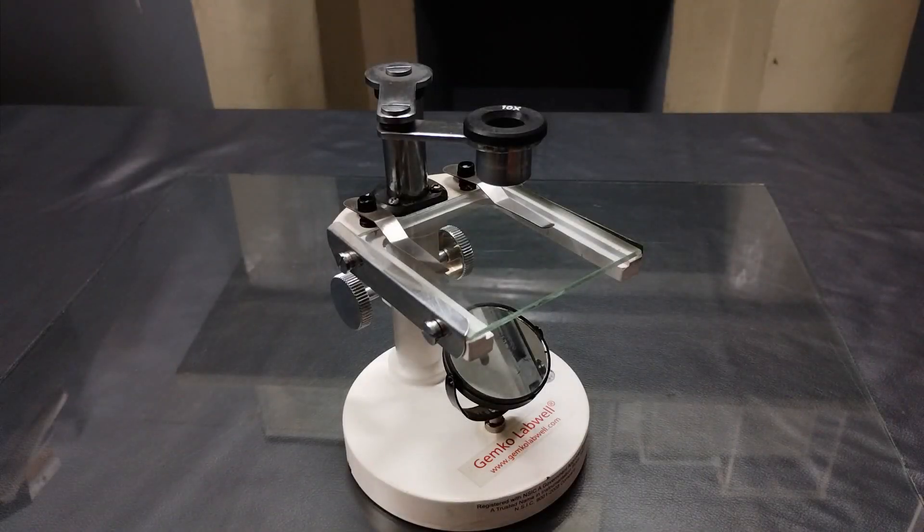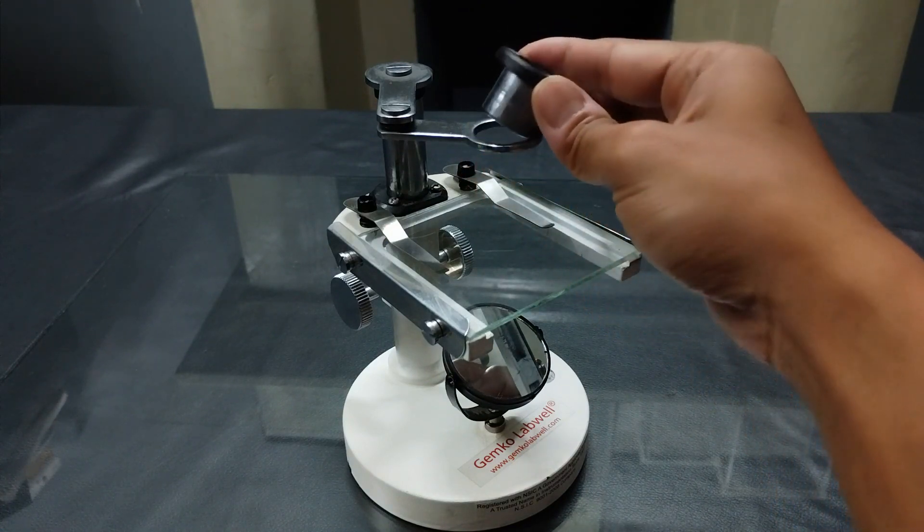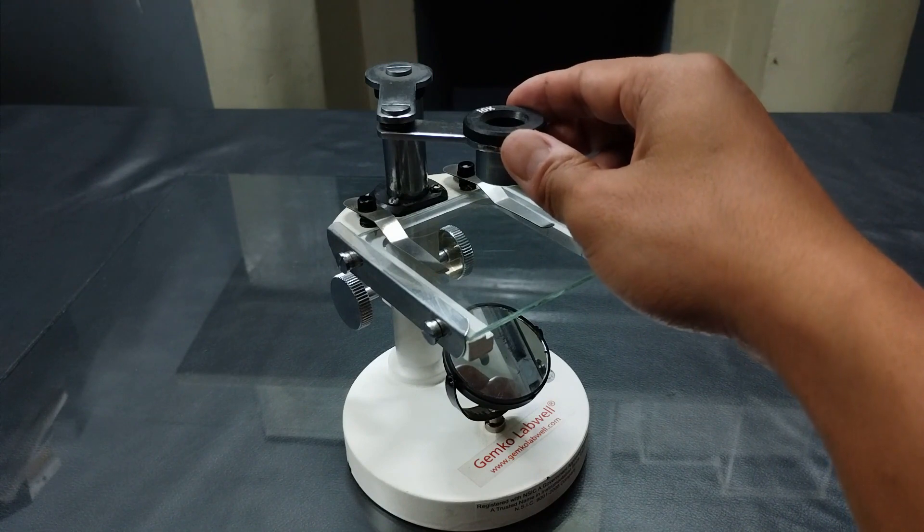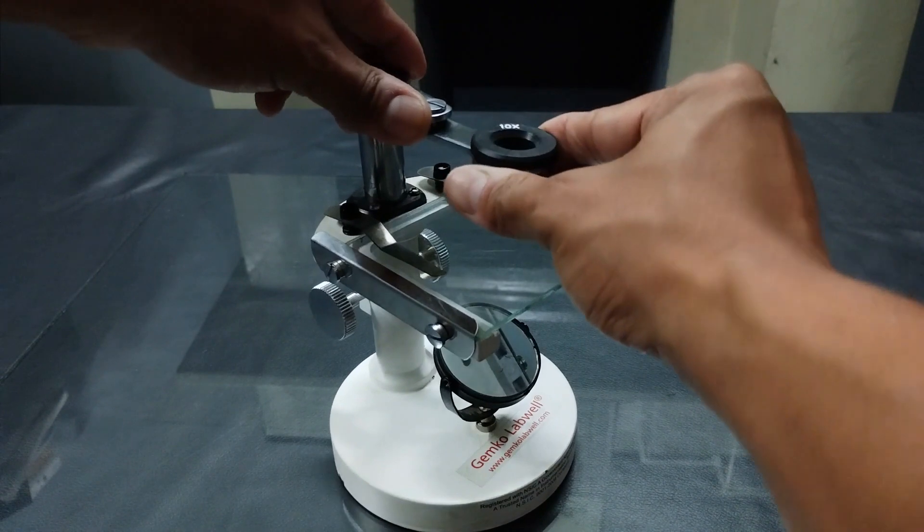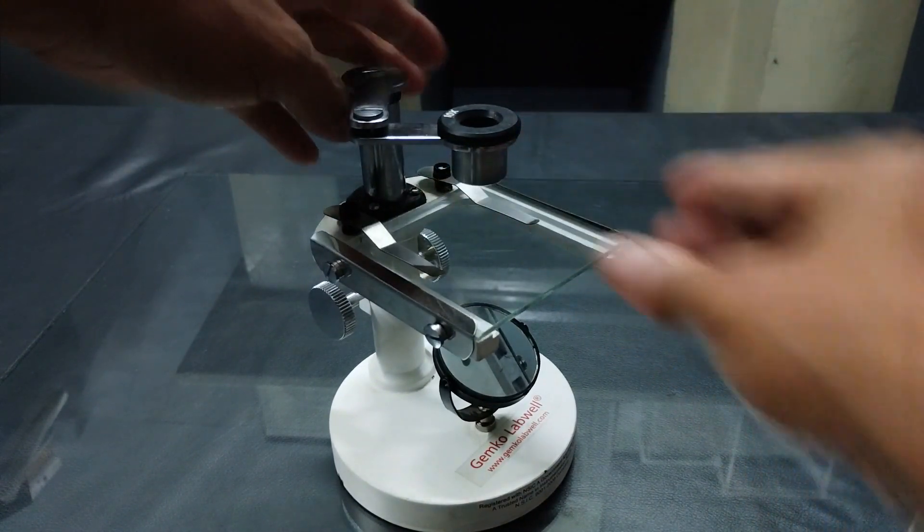A typical simple dissecting microscope is essentially a single lens magnifying system consisting of a simple eyepiece, either 10x or 15x, made of a pair of convex lenses mounted on a foldable and extendable arm which is in turn fixed terminally onto a vertical stand or focusing limb.